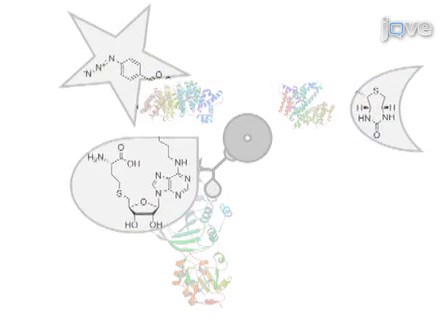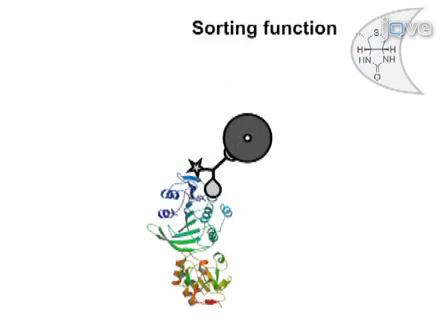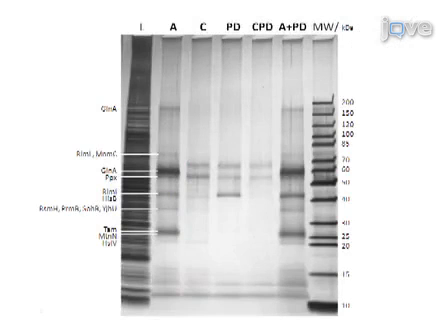Next, the capture compound protein conjugates are separated from the lysate, washed thoroughly, released from the solid support, and trypsinized in order to identify the captured proteins by mass spectrometric analysis of the tryptic peptides. Results are obtained that show the straightforward isolation and identification of methyltransferases from a cell lysate of Escherichia coli based on capture compound mass spectrometry.